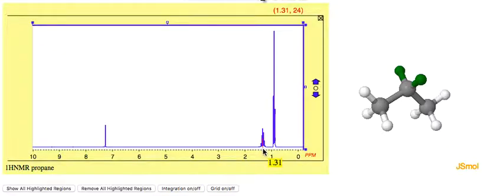But over here, this peak being for the 2 methylene CH2 hydrogens, that looks just like the other peak we saw on the other spectrum. It is a septet. It's being split by these other 6 hydrogens here. So same kind of shape, but it's in a very different location than the other one was in the last spectrum. The other one was out here because there was an O, and this one there's no O, so it's pulled on back into this position.